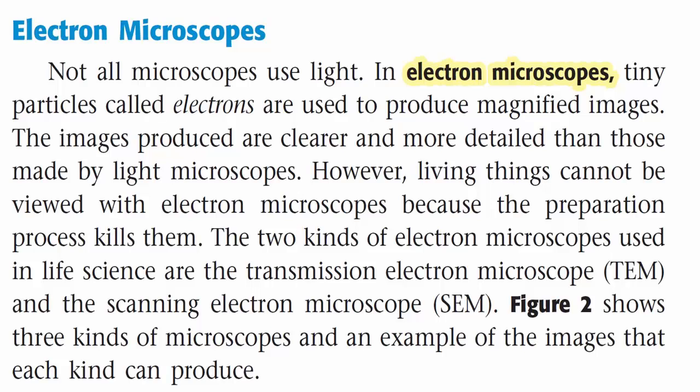The two kinds of electron microscopes used in life science are the transmission electron microscope, or TEM, and the scanning electron microscope, or SEM. Figure 2 shows three kinds of microscopes and an example of the images that each kind can produce.